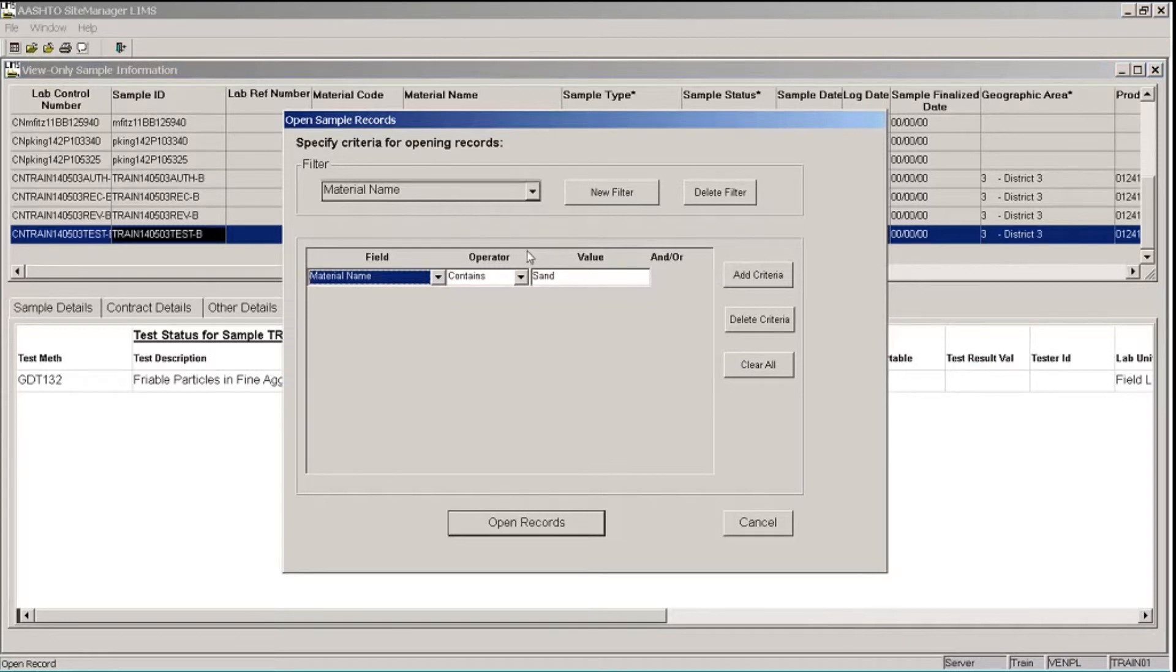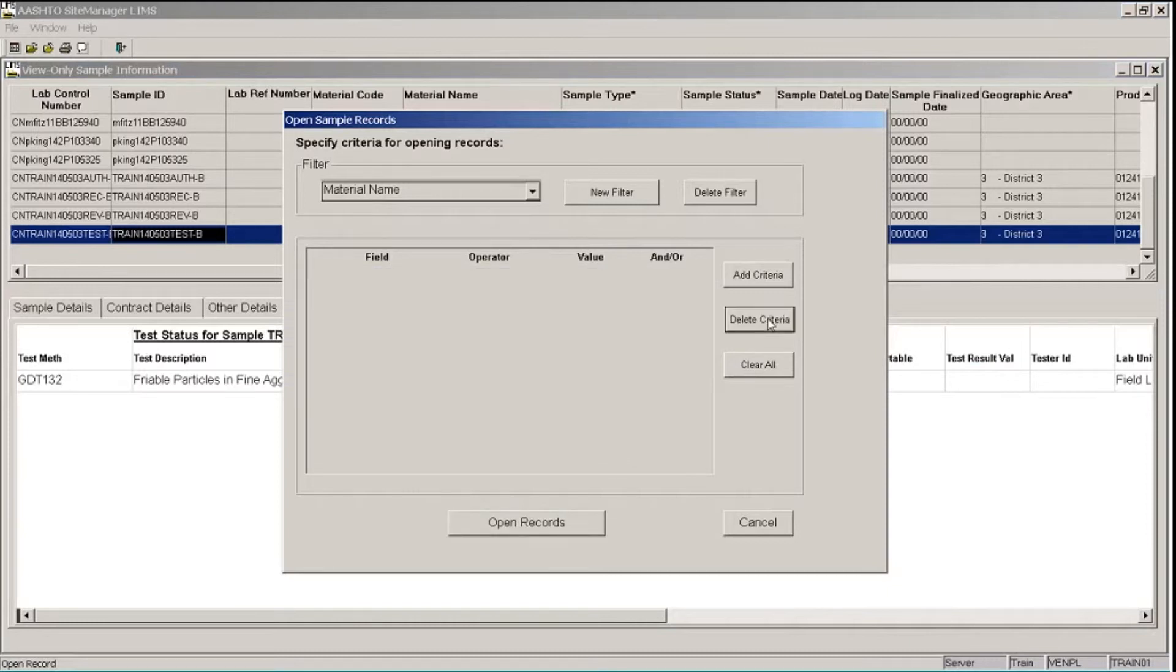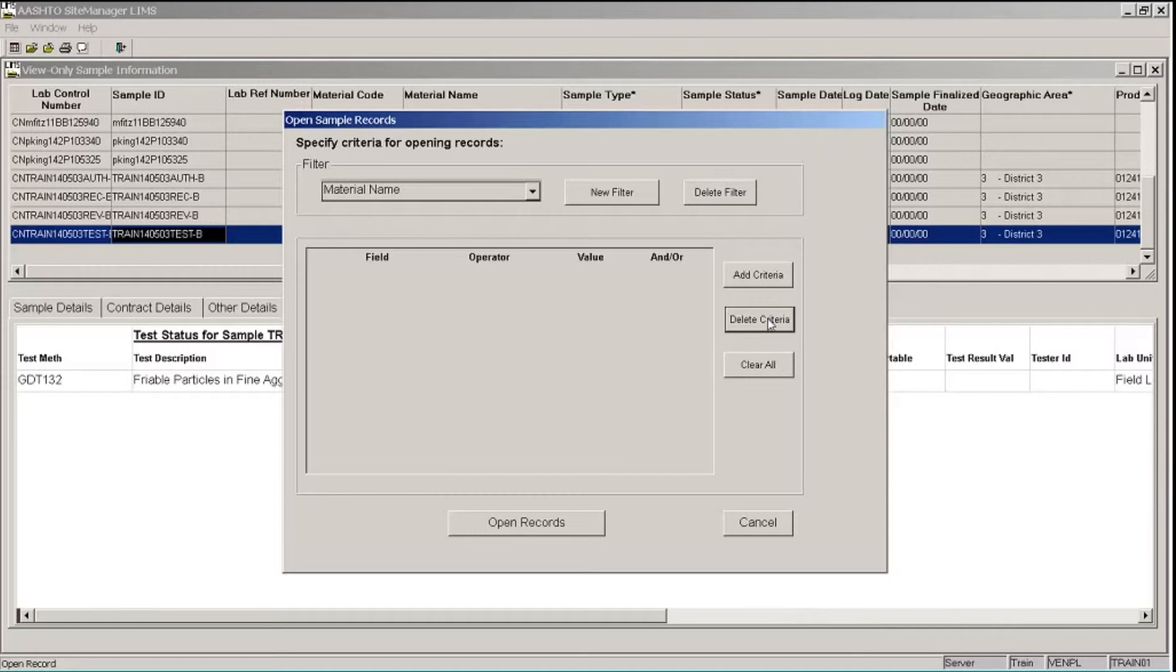First I want to delete a criteria. So I'll click the Delete Criteria button, and it will delete the last criteria row on this particular filter. Now I only had one row, so it deleted that row. If I had more than one, it would start with the bottom row.